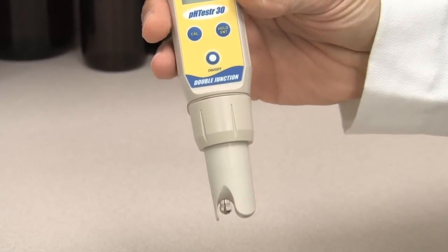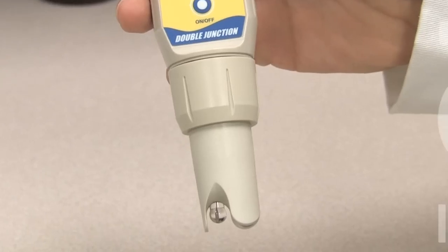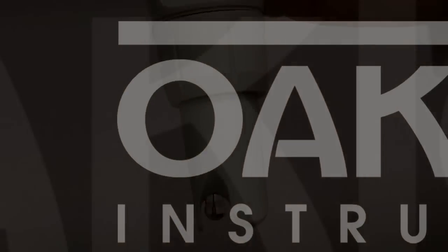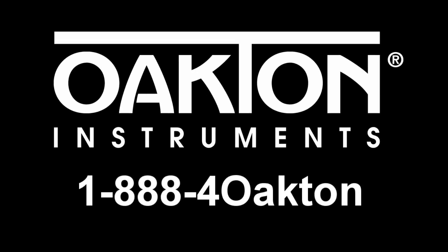Now you're ready to recalibrate your pH tester and take your measurements. It's that easy. Look to Oakton to meet your pH testing requirements. For additional tech support, call 1-888-4-Oakton — that's 1-888-462-5866.